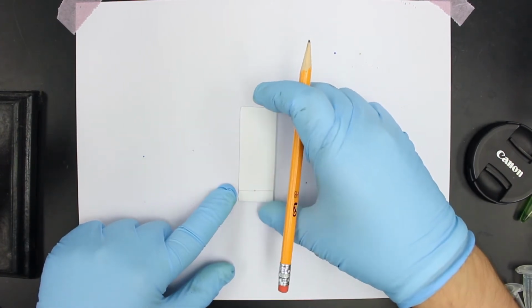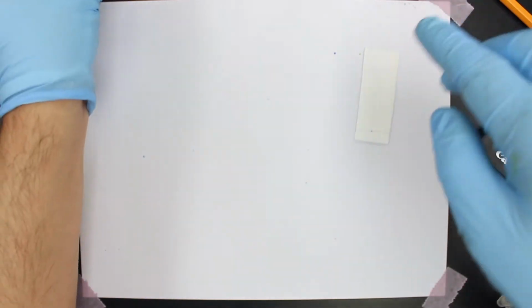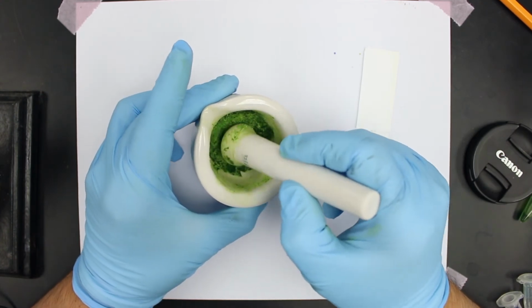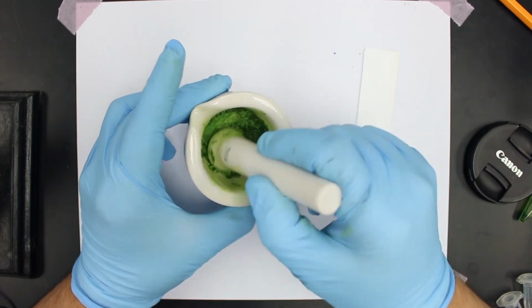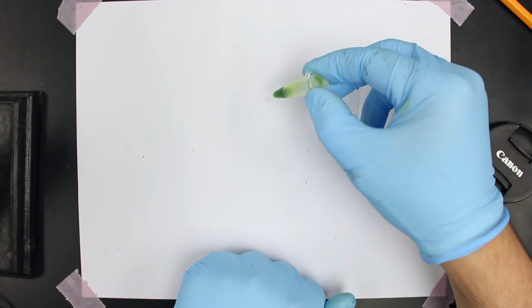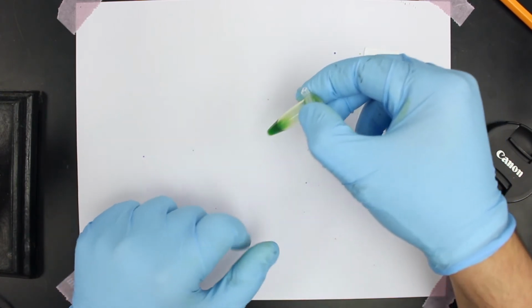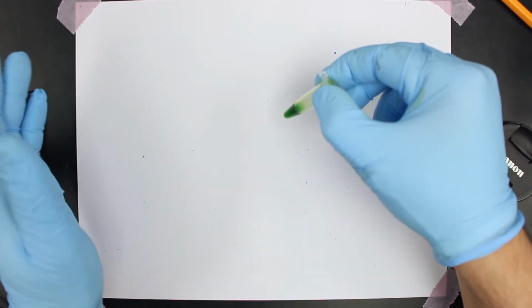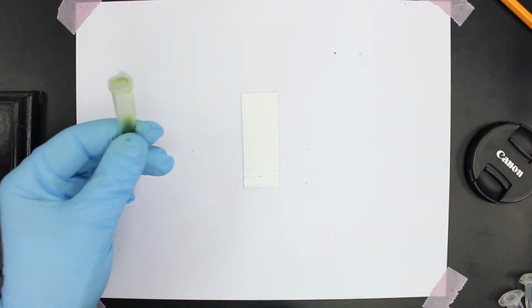And the analysis we're going to do is dealing with a colored mixture. So what I did was I went outside, I grabbed a leaf from the tree outside, and I ground it up in this mortar and pestle. And then I extracted this mash with some acetone, and now I have a leaf extract. So as you can see, it's nice and green from the chlorophyll, and we can do a TLC. Now this is interesting because the person who invented chromatography was originally separating pigments from leaves, so this is sort of like recreating the discovery of chromatography.